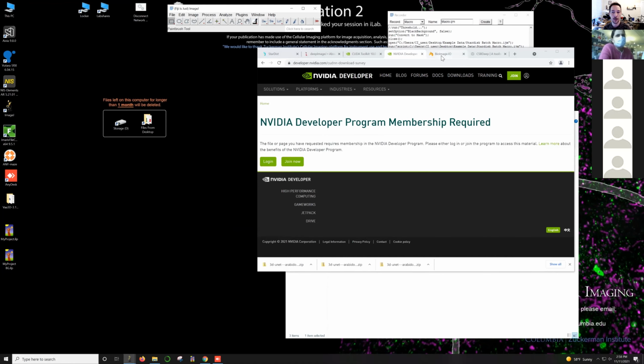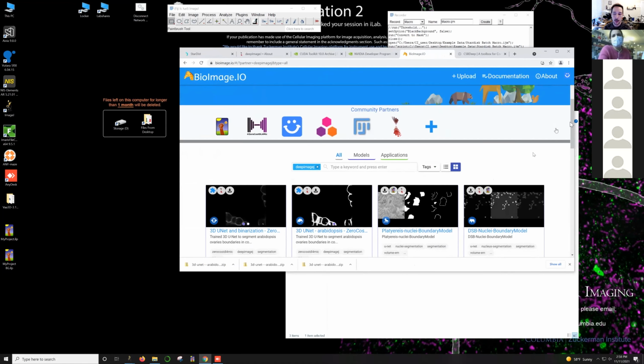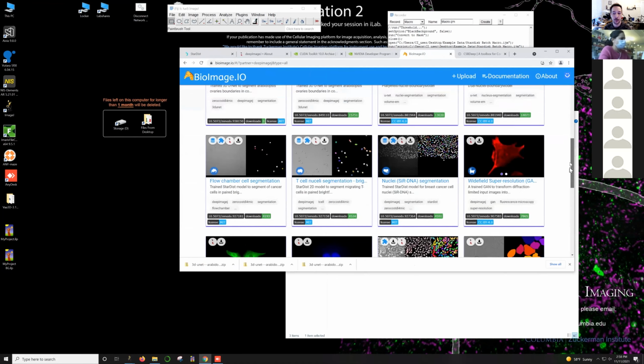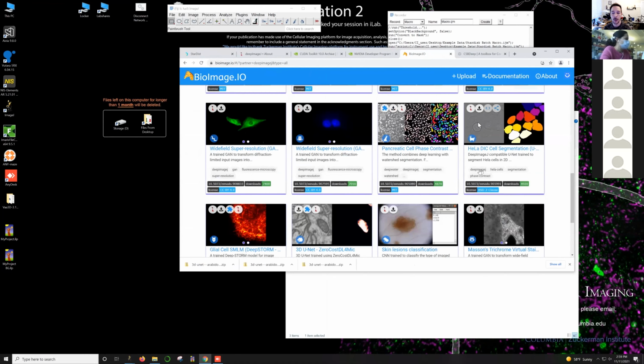So there's a website called BioImageIO. This is kind of an effort to make all these tools available to people, not just for DeepImageJ, but for other platforms as well. People are sharing pre-trained networks. So, if you're lucky, there's something in here that's very similar to what you're trying to do. And there'll be examples of restoration, as well as some great examples of converting bright field or DIC images into images that you can get nice masks from. There's some really great things that are already available for this.